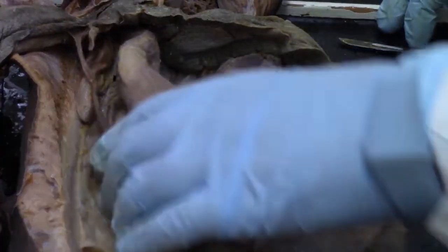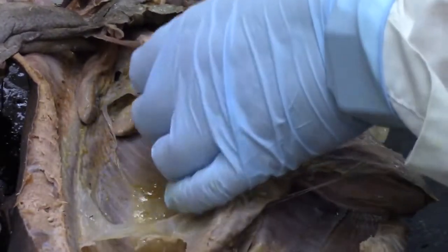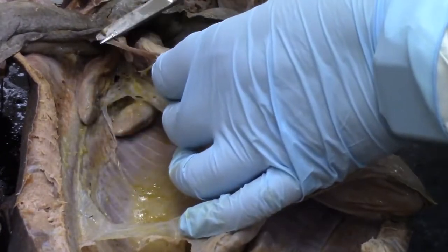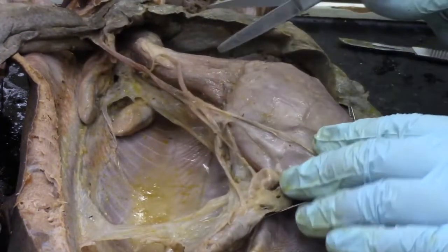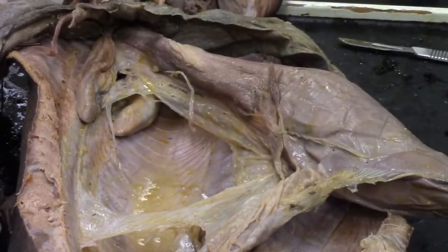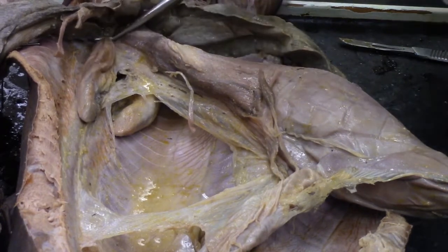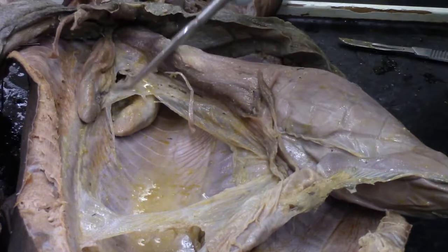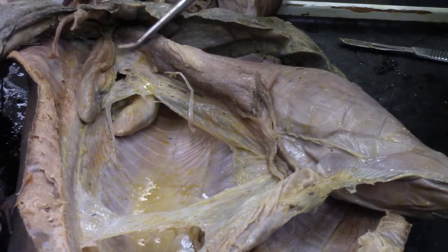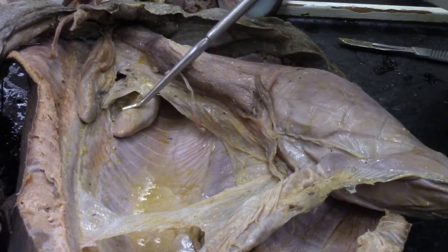If we move our stomach off to the side, we end up with some veins in the way, veins and arteries. This one here is joining up with the liver, so that's going to be a hepatic vein. I'm just going to cut those so that they're out of our way, because what I'm really wanting to show you up here is the testes. They are long ovals that are up quite far anteriorly, and they are paired. We can see the bottom of the other one on this side here.